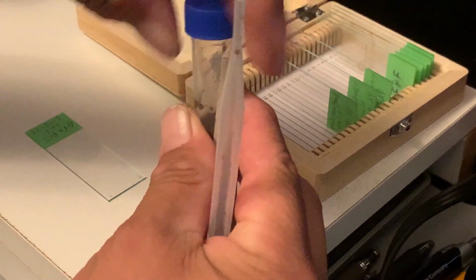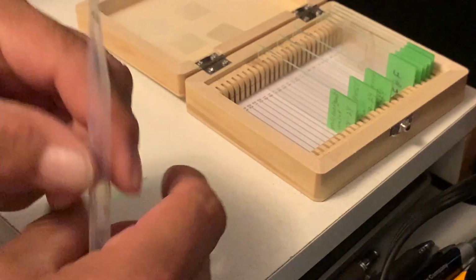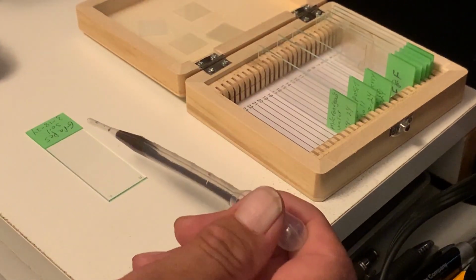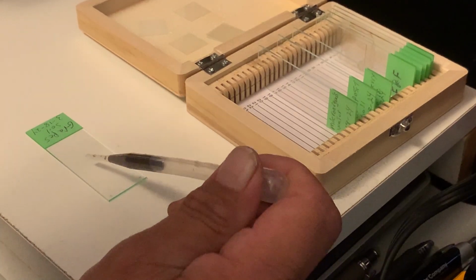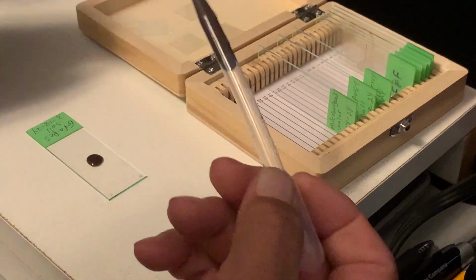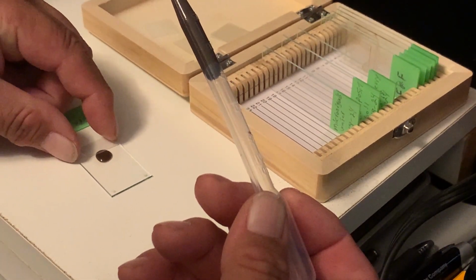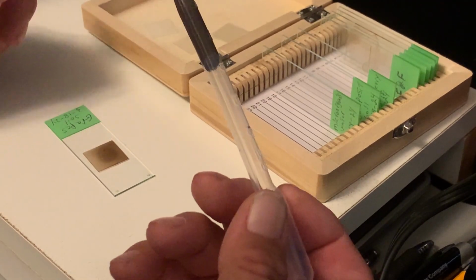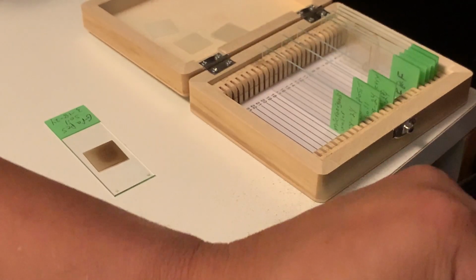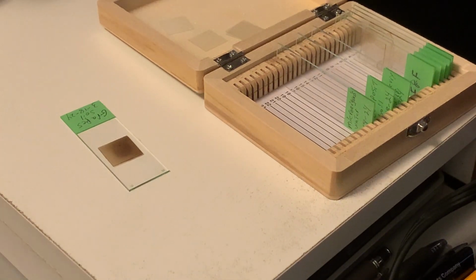Sorry, it only takes a little bit. Let's put that here. Now, just a little drop. Whoa, that might be too much. Put the cover glass. Perfect. All right, and then that's a good slide.